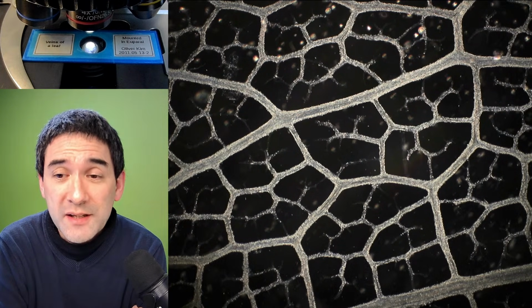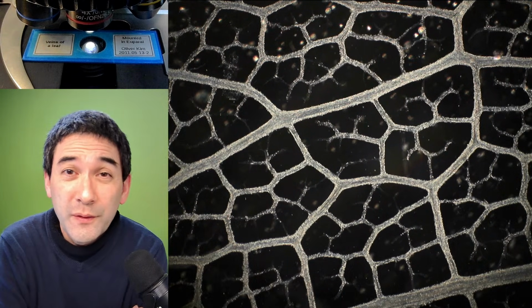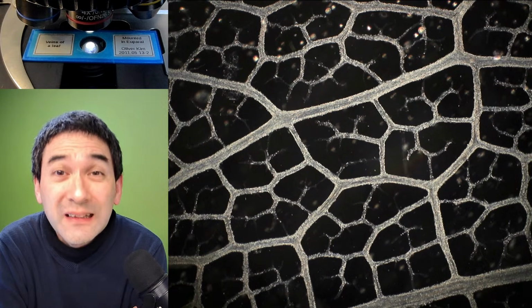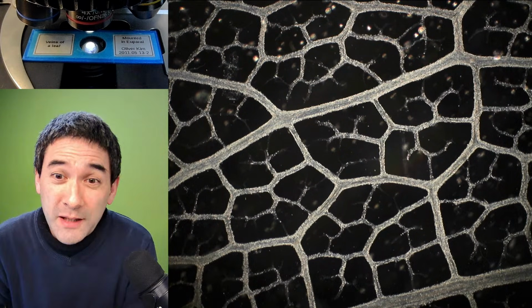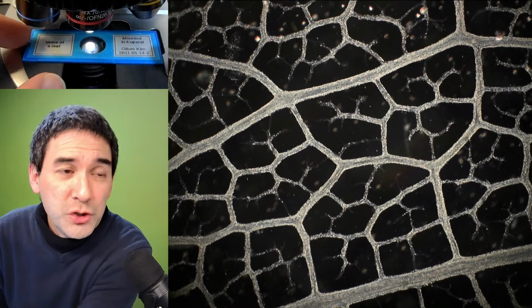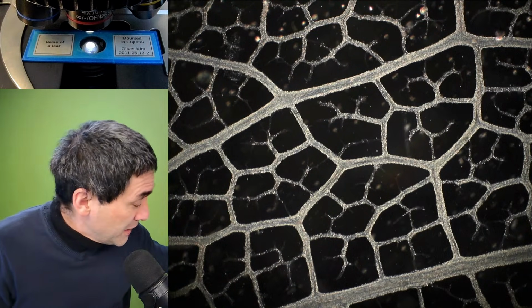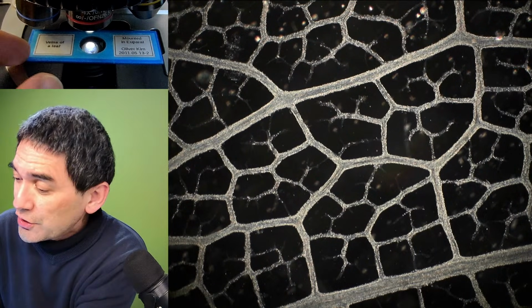Now, that's quite interesting. I didn't know that. As a matter of fact, it is something one has to be aware of when dealing with antique items. In the past, they also used, for example, radioactive uranium glaze for ceramics. People didn't know that radioactivity was a problem at that time. So 100 years ago, with the whole issue concerning safety, people simply didn't know many things, right? So it doesn't surprise me that they may have used it. I'll show you a couple of my antique slides that I have as well, but I'm going to just go through those here just to share with you a little bit.